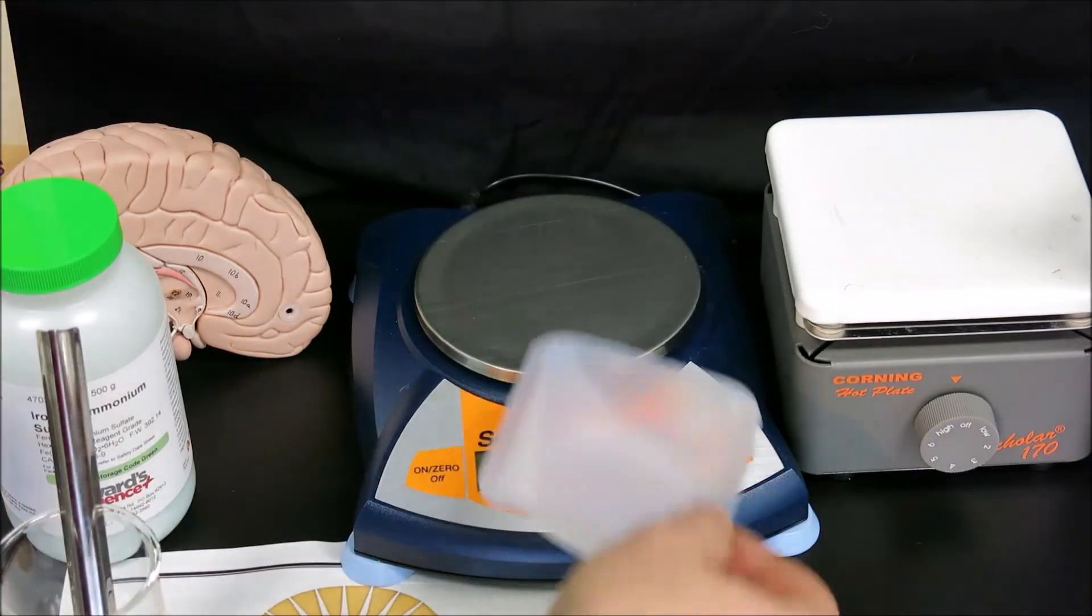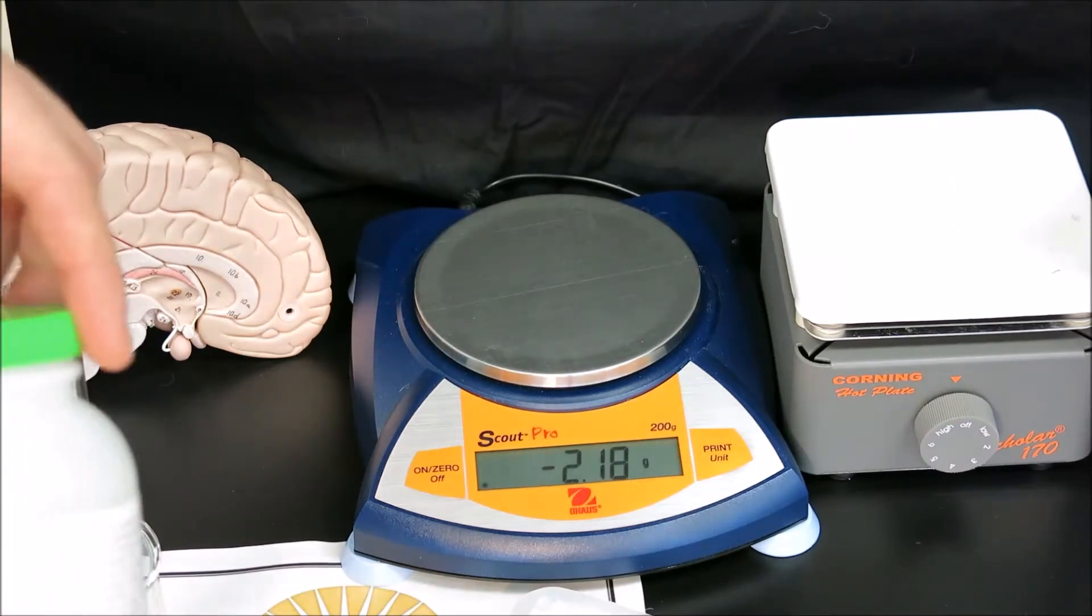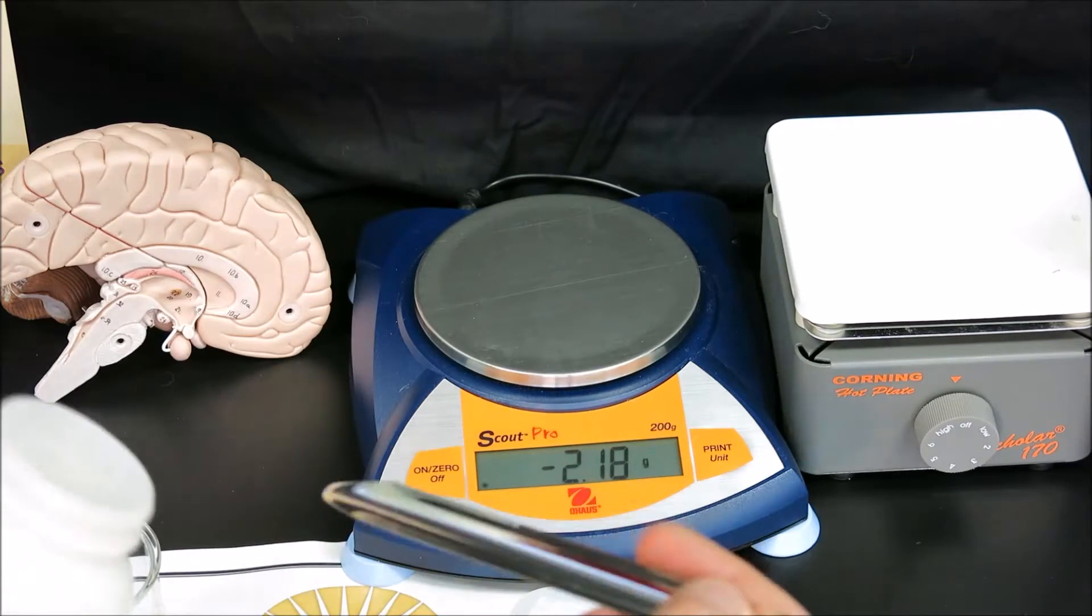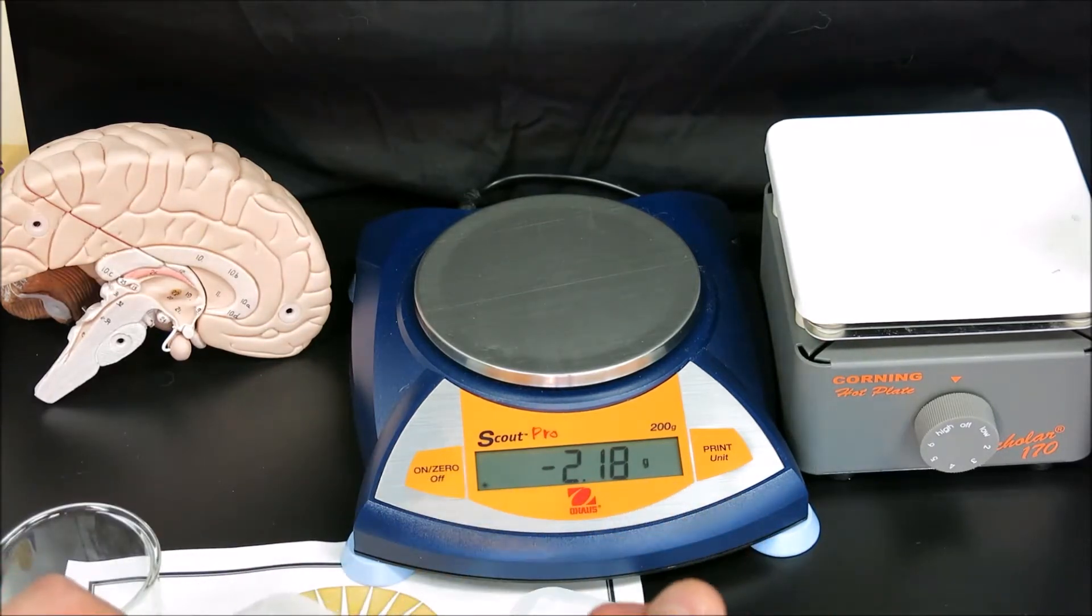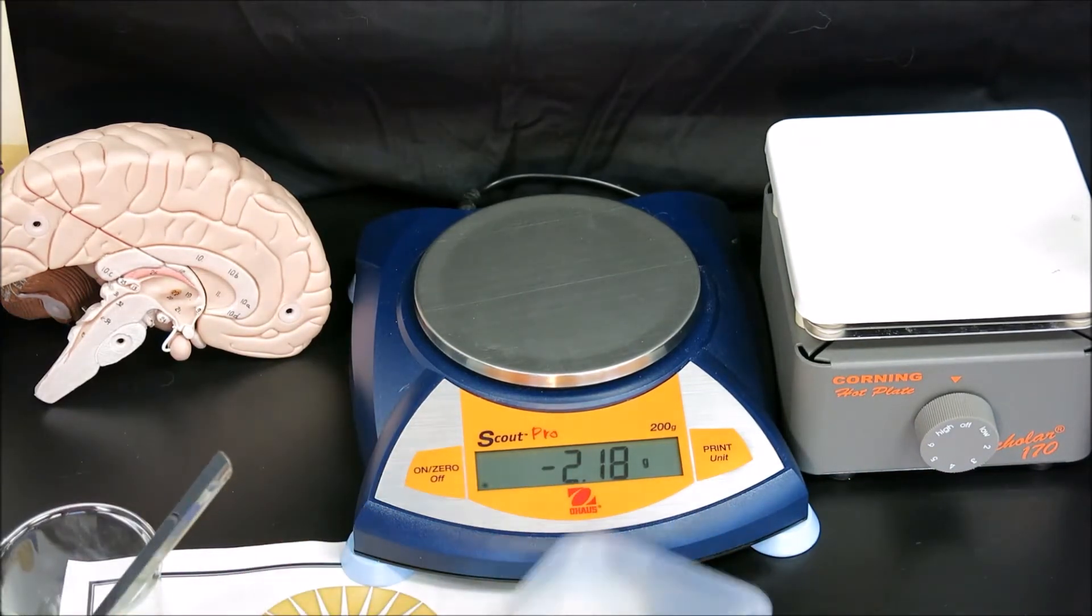We never want to pour solid on the scale because if we miss, the chemical could damage the scale. Instead, we take the weigh boat off the scale, and using the spatula, pour some solid into the weigh boat, then put the weigh boat back on the scale to test the mass.